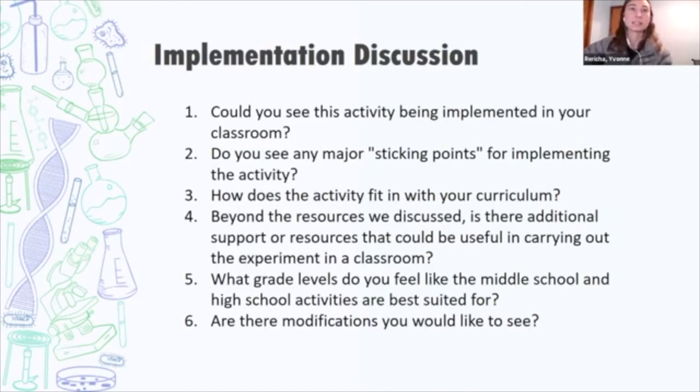But in those cases, a lot of the time, those endocrine disruptors will have not an S shape, but maybe more like a U shape or the reverse. And those are called non-monotonic dose response curves. So there are different shapes that you could definitely see, and it could definitely stimulate some interesting discussion.